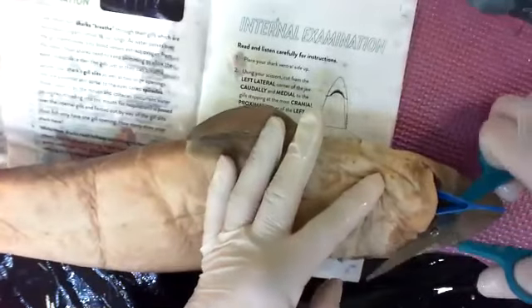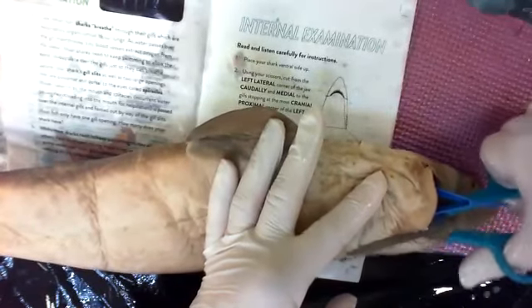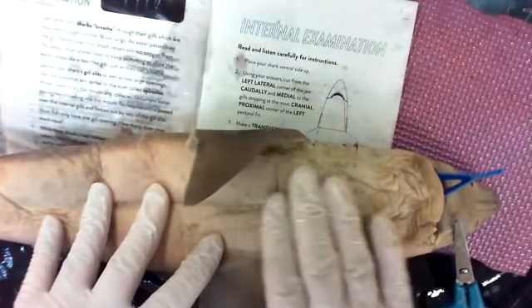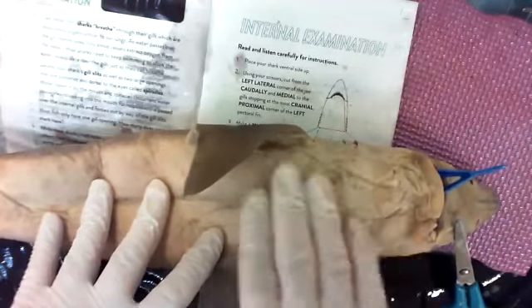So I'm wiggling, and then I take a little bite, little bite, little bite, little bite. For real, little bites. Because the shark's skin, remember, is like teeth. It's a hard armor. In fact, they used to use shark skin like sandpaper to polish things, because it's smooth, but very aggressive for fine polishing, like polishing diamonds and rubies and gems or wood or whatever. But it can really get in there. The enamel stays hard and you smooth things over.